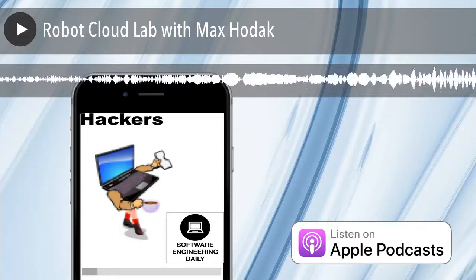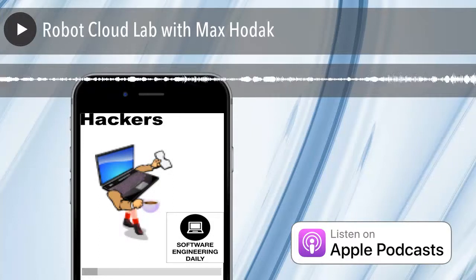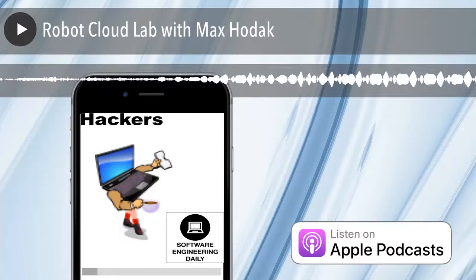Max Hodak is a co-founder of Transcriptic. Max, welcome to Software Engineering Daily. Thank you. Transcriptic is a robotic cloud laboratory.